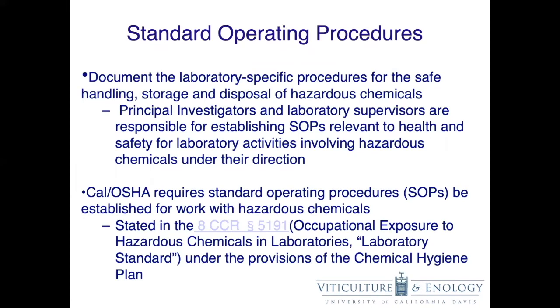Now let's get into SOPs and why they are important. Standard operating procedures, or SOPs, are known as administrative controls. The purpose of an SOP is to mitigate the risk of exposure of employees to any hazards present in the workplace. SOPs document the laboratory-specific procedures for safe handling, storage, and disposal of hazardous chemicals.